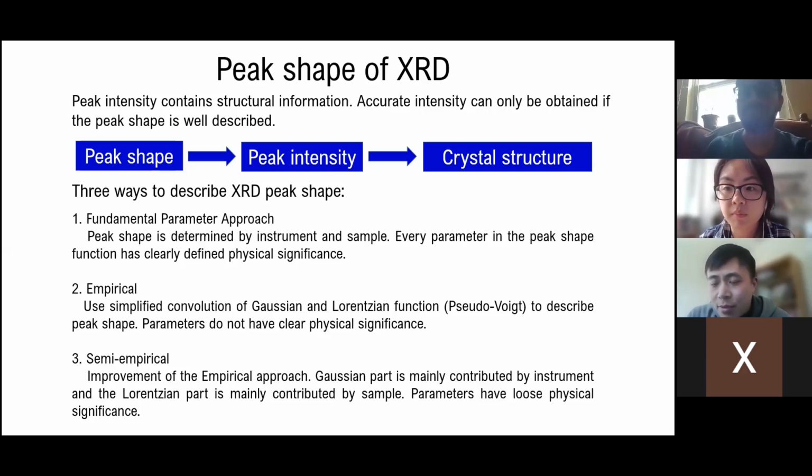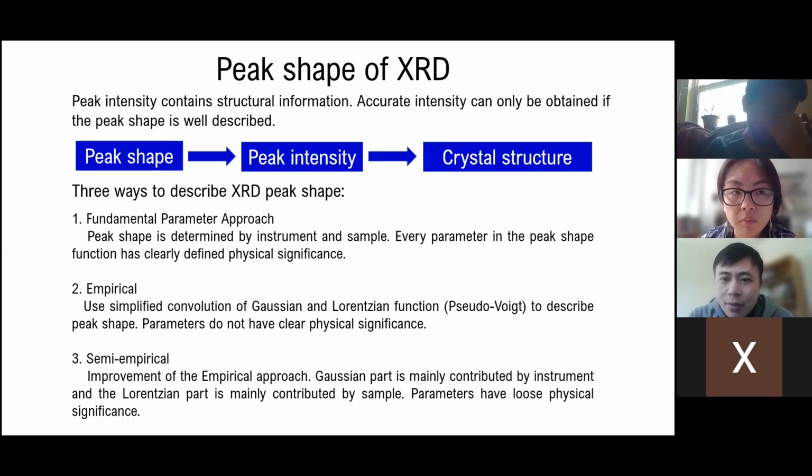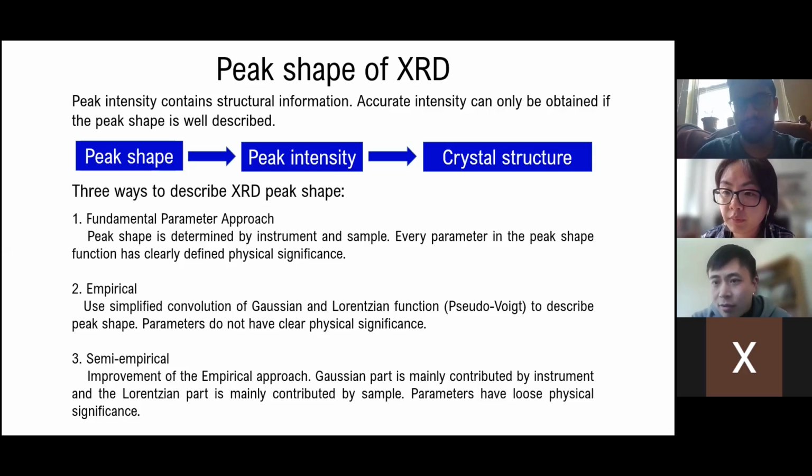So we always observe smaller peaks at high angles, right? That's a general trend. Also, the neutron differs from the X-ray in that the neutron does not have the effect of the atomic form factor. It's only influenced by the disorder factor, right? So that's some sort of benefit of using neutrons.